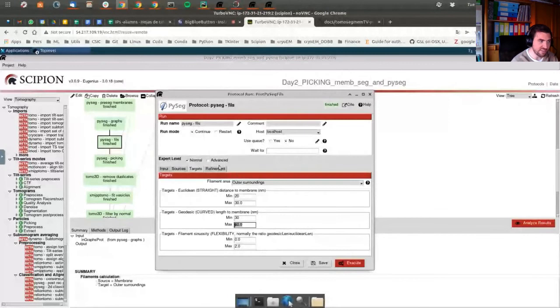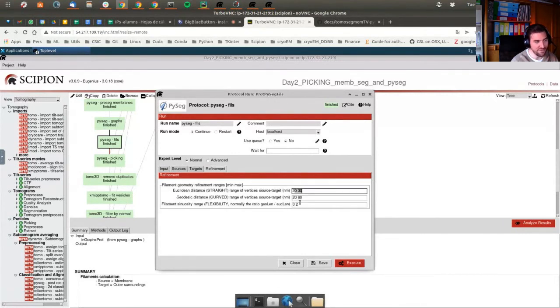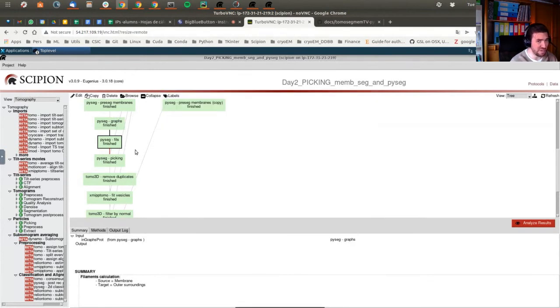My past self was better than me, and for the tutorial it was using no filter here from 0 to the value, and using in the final filter the considerations I've considered before, just during the explanation. But everything is completely well explained in the tutorial. So if we execute this in my machine, I think it was about 5 minutes, 7 minutes, something like this. The result would be as expected.